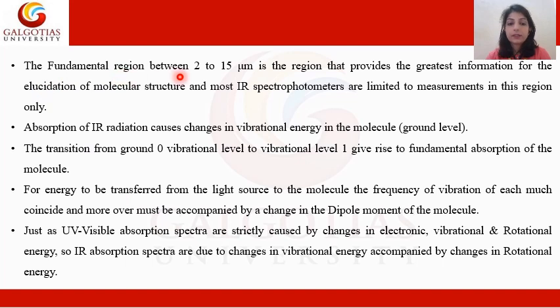The fundamental region from 2 to 15 micrometers is the region that provides the greatest information for the elucidation of molecular structure, and most IR spectrophotometers are limited to measurement in this region only.